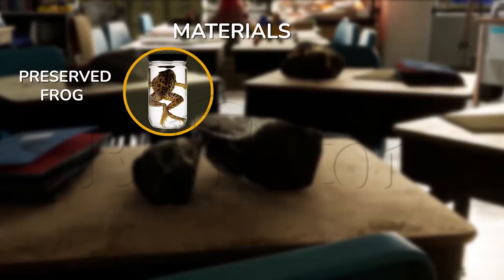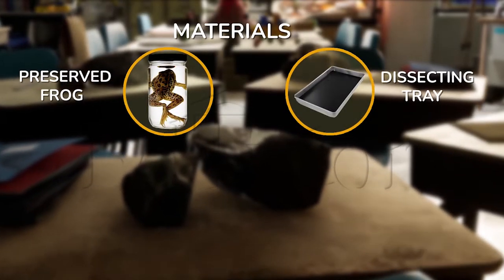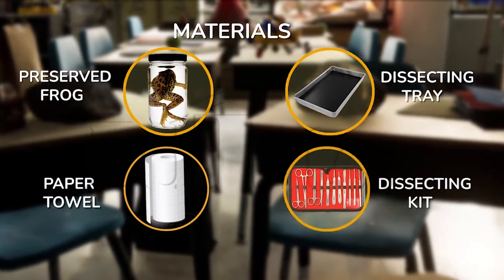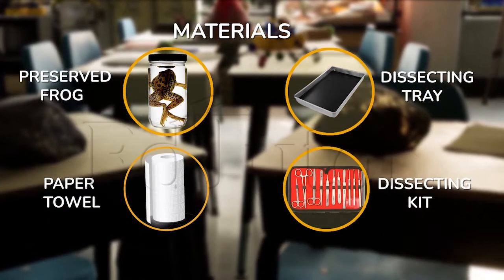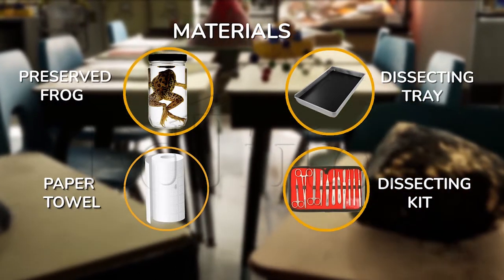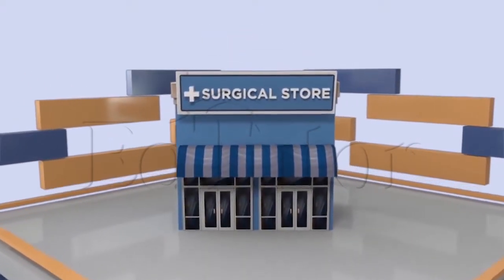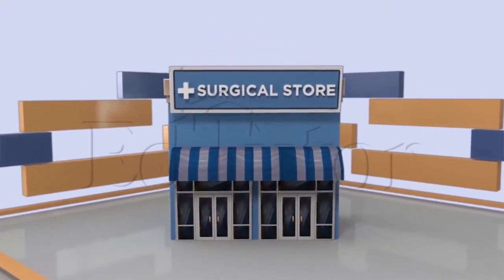Now, in addition to your lab aprons, you will need a preserved frog, a dissecting tray, some paper towels, a dissection kit. Dissection kits can be commonly found in stores that sell surgical supplies. So just look for it in a store near you.